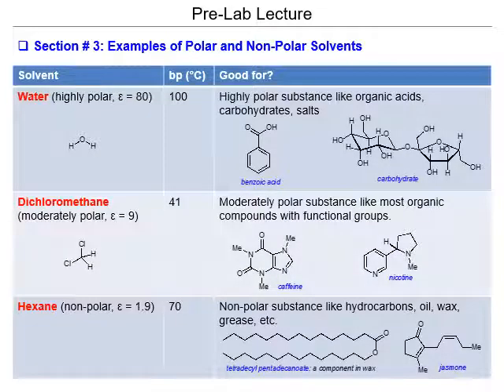Here are some examples of solvents. Water, as you can see, is very polar, and you can explain it the way I said. You have two dipoles here going towards oxygen, and the geometry of the molecule allows them not to cancel. That's a consideration that you will see in your lecture, but you can consider it right now. But also the boiling point of water is something else that you must consider when you perform crystallization.